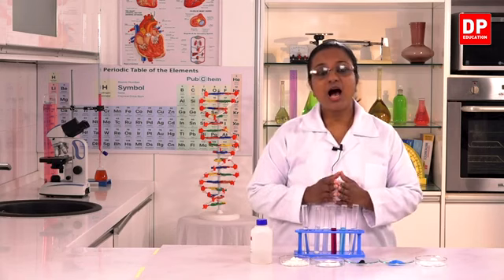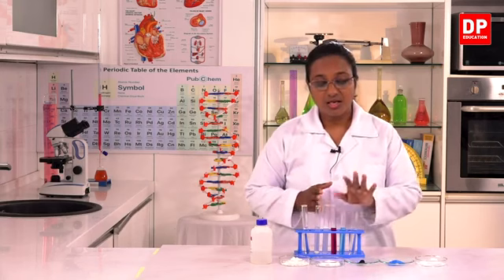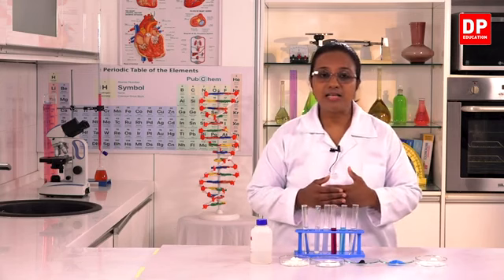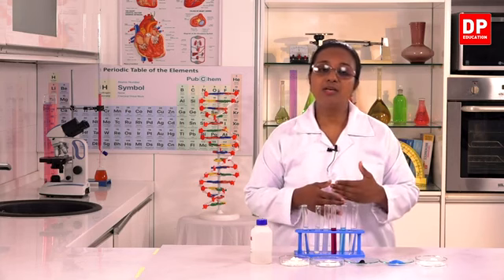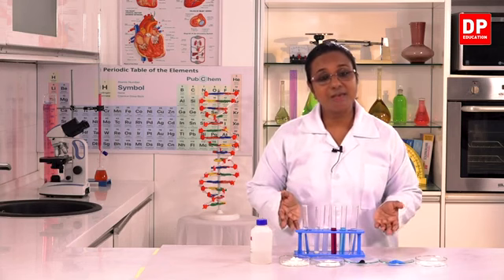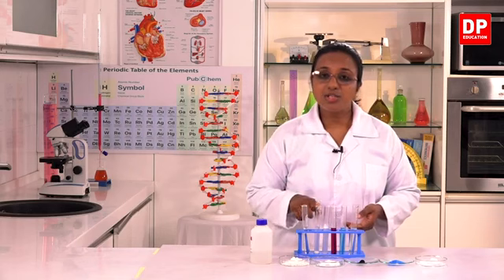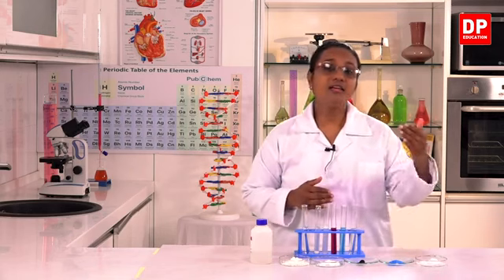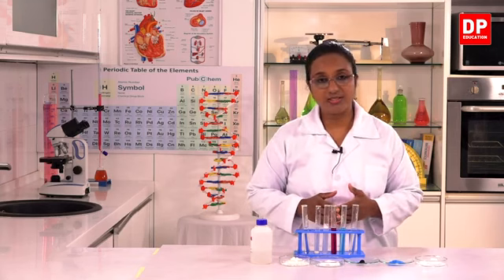So, this is how we classify these mixtures. These which have uniform transparency, that means the solutes or the components are distributed uniformly throughout the mixture, we call them homogeneous mixtures. Whereas in the washing powder and flour mixtures, the distribution of the components is not uniform throughout the mixture.